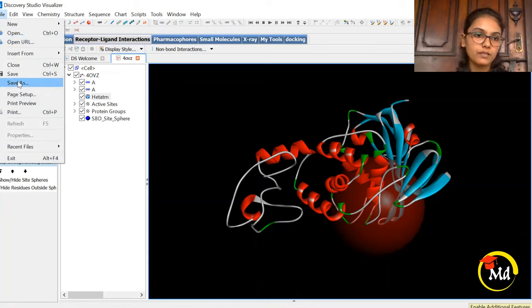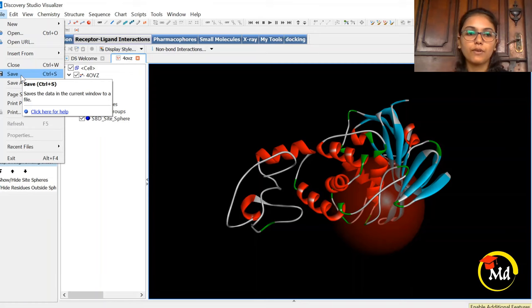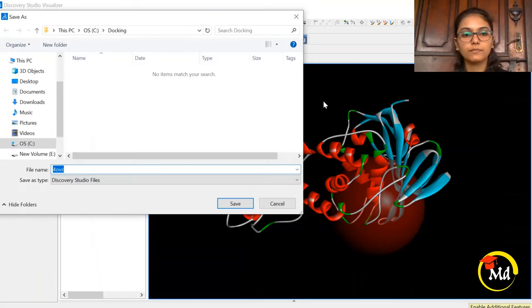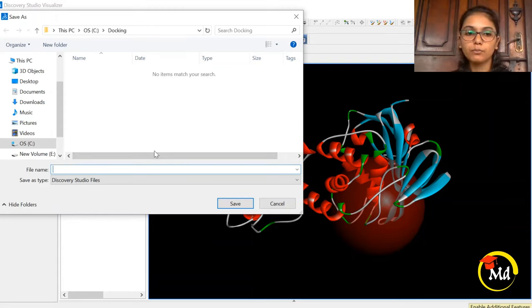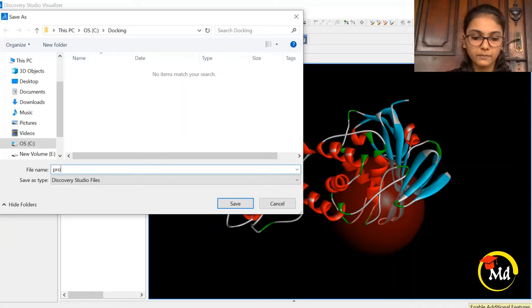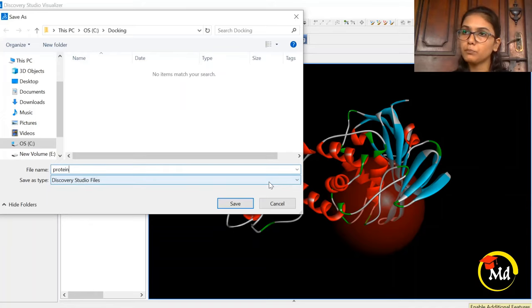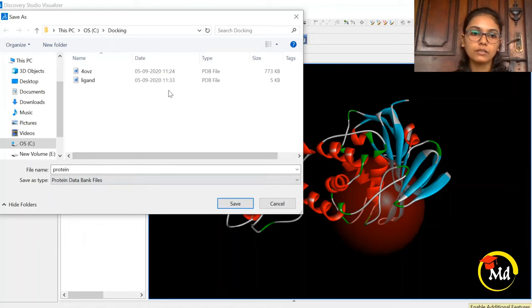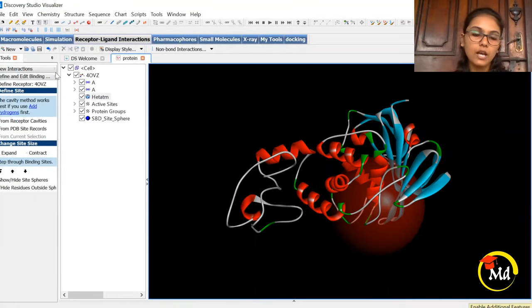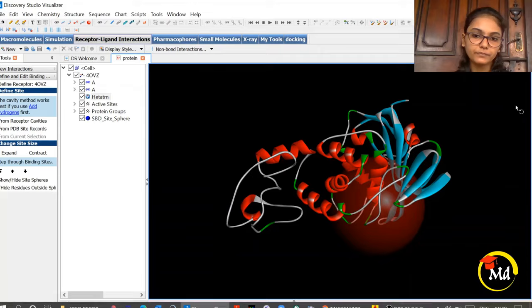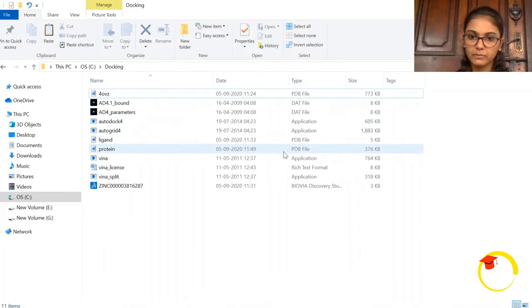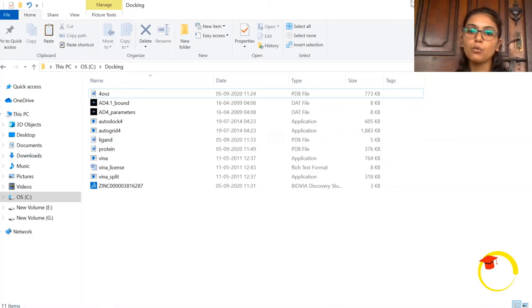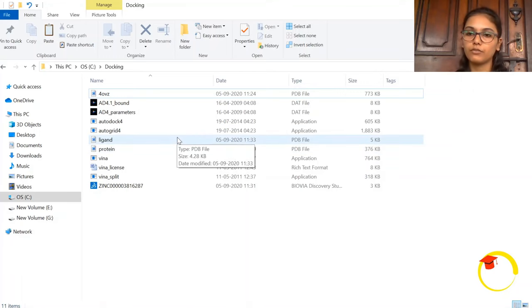Now we need to save the protein in PDB format. Go to File, write the filename as 'protein', select Protein Data Bank file (PDB format), and hit Save. Now in the docking folder we have the protein in PDB format and the ligand in PDB format. Our protein has been prepared and now we will prepare the ligand in AutoDock's MGL Tools.